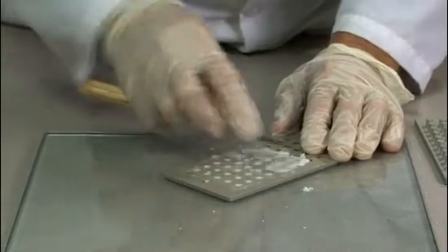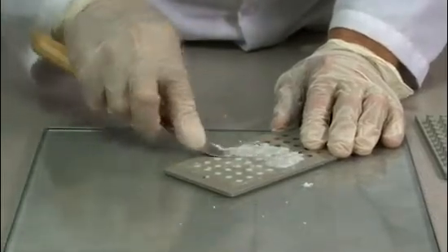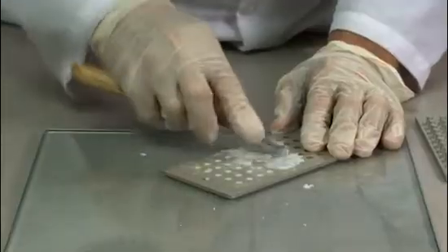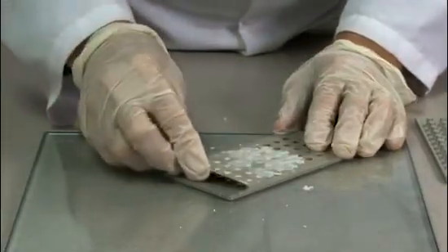If you begin to run out of material, completely fill only the tablets that you can. Do not produce partially filled tablets.